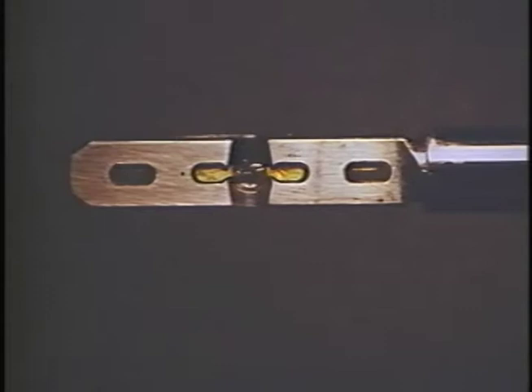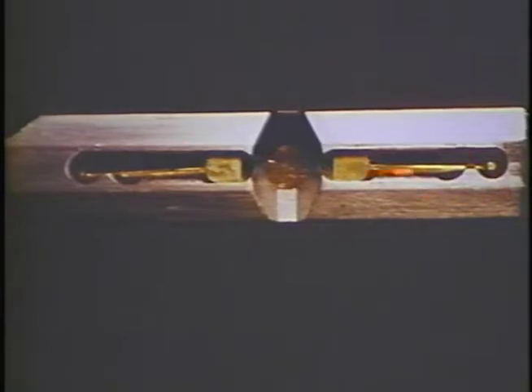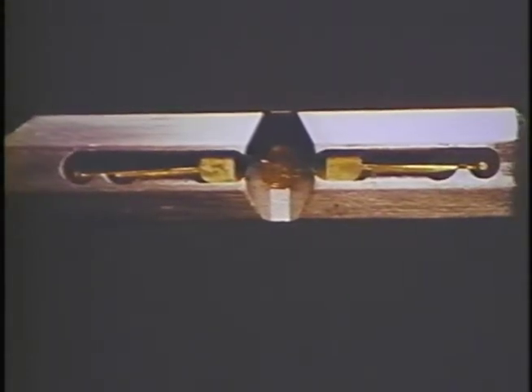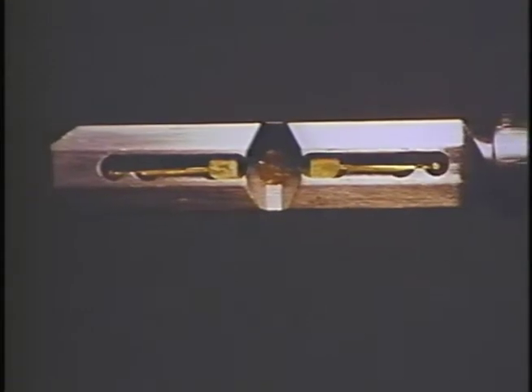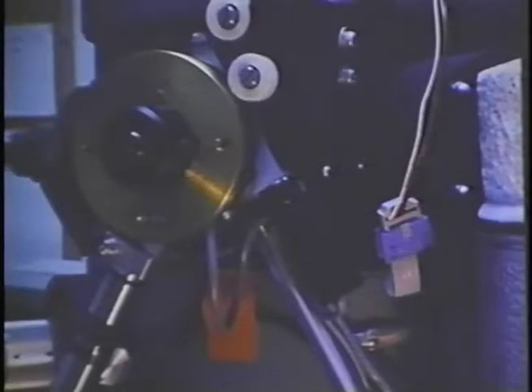The hold-down clamps are two edge-on hold-down clamps so that there's nothing covering the central area of imaging on the grid. And this shows the back side, and they're just these two simple spring clips used to hold it down. This ends up working extraordinarily well. We can collect data; the actual place where this eclipses is about plus or minus 82 degrees of tilt. Routinely, we collect data to about plus or minus 75 degrees. Beyond that, we find the thickness of the specimen gets too thick for the microscope.